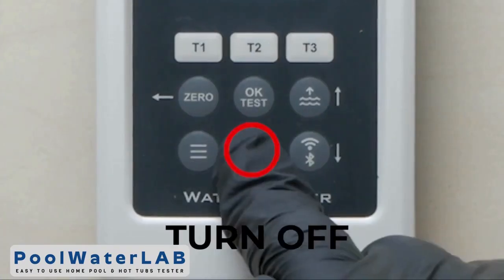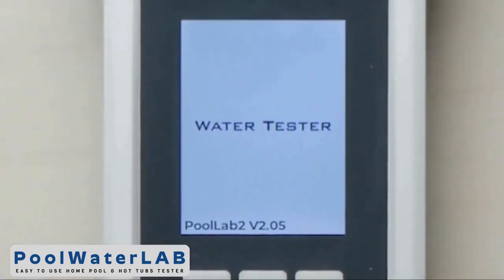To turn off the device, press and hold the off button. Run the other test if necessary.